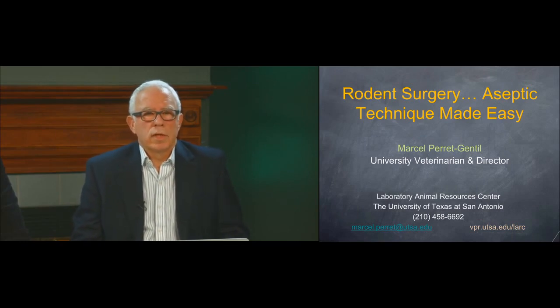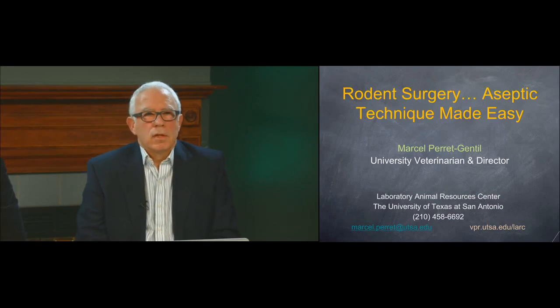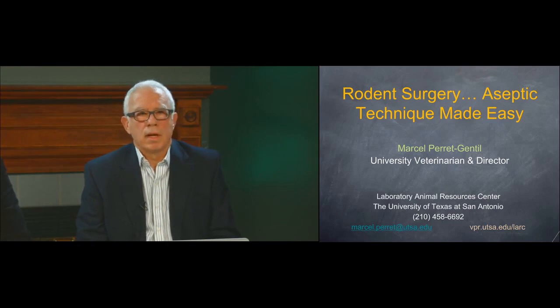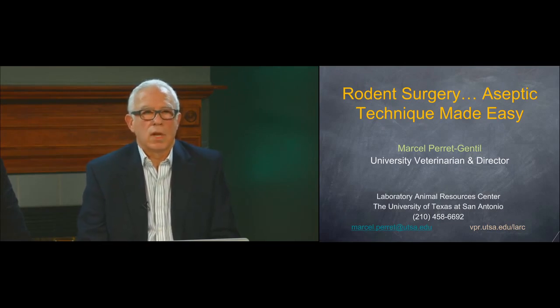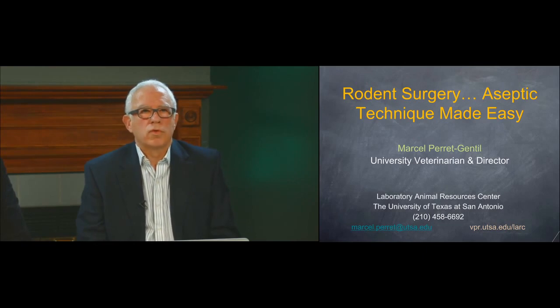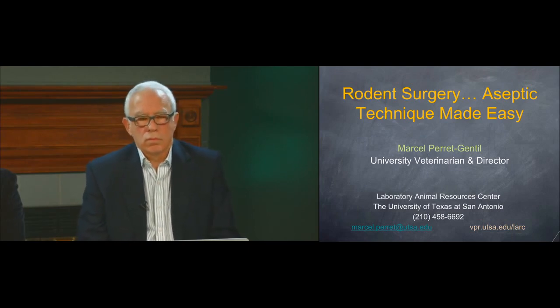So we have our discussion, we end the discussion, and I eventually asked him, I want to see how you're doing the surgeries. Well, I go to watch the surgeries in his lab, and I was horrified by what I saw. I mean, it's to a certain extent what I expected. First, I see that the animals are being clipped, and they're using a number 10 blade instead of a number 40 blade. Well, a number 40 blade shaves the animal down to the skin, a number 10 blade leaves a lot of hair in place. Then they do a scrub of the animal that was inadequate with betadine solution. We'll get into this in a few minutes.